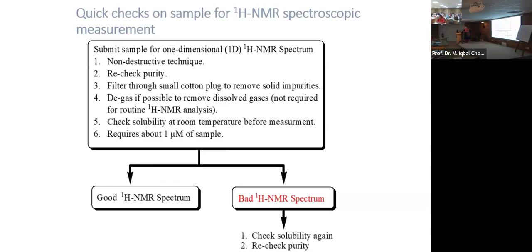So you said we can make our own experiment, not only for identification, to know the structure of a compound. For example, if someone has an experiment to study by time, like kinetics, yes, you can do it. You can design your own experiments.